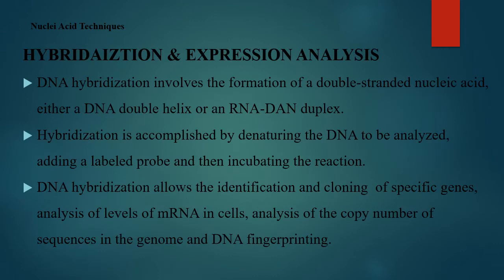So now we come to hybridization and expression analysis. So when we talk about hybridization, we are talking about the process which combines 2 single-stranded forms of DNA or RNA molecules and then allowing them to form a double-stranded molecule.